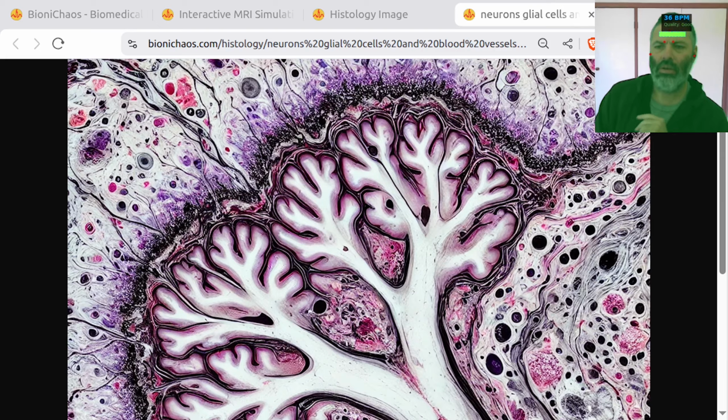Of course, cell counting identifies and tallies cells, tissue classification tags different tissue types, and measuring shape or size gives details about structure dimensions. Density shows how tightly packed cells or structures are, co-localization explores how different features overlap, and feature extraction picks specific measurable traits like shape or texture. Segmentation divides the image into meaningful parts. This suite of tools helps break down complex images into understandable steps.